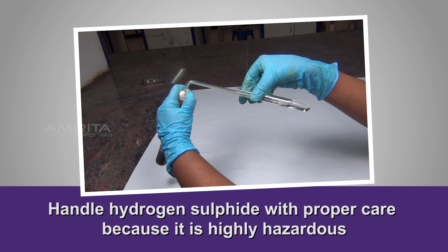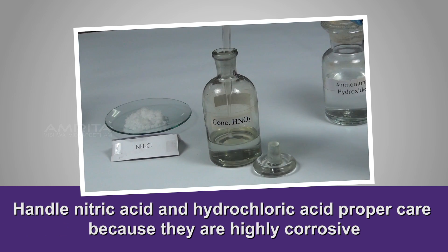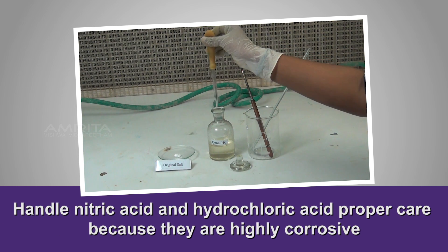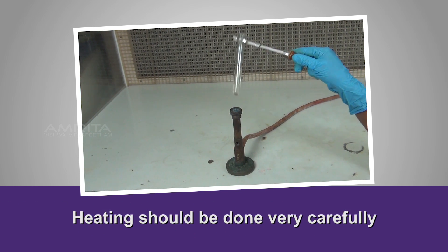Precautions: Handle hydrogen sulphide with proper care because it is highly hazardous. Handle nitric acid and hydrochloric acid with proper care because they are highly corrosive. Heating should be done very carefully.